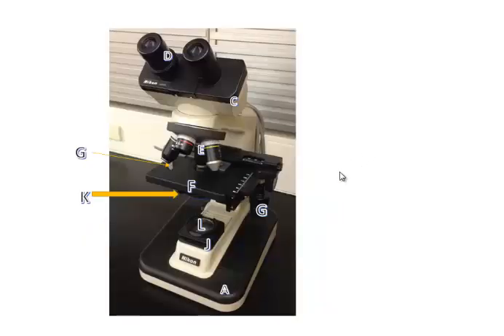On this next page you see some of the same structures. Here are your ocular lenses. Here are your objective lenses. Here you see the stage. Here, this metal, silver, is the mechanical stage. Here are the knobs you use to move the mechanical stage so you can adjust where the slide is located. Here is the knob for the iris diaphragm, which again controls the amount of light getting through. Here's your substage light. Here is your condenser, and again here you have the base of the microscope.